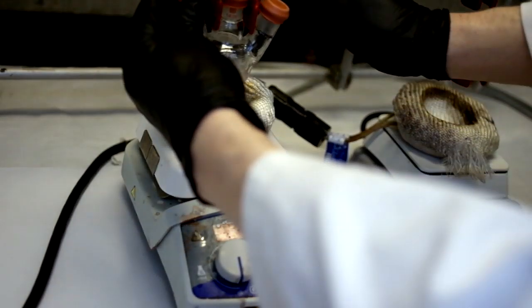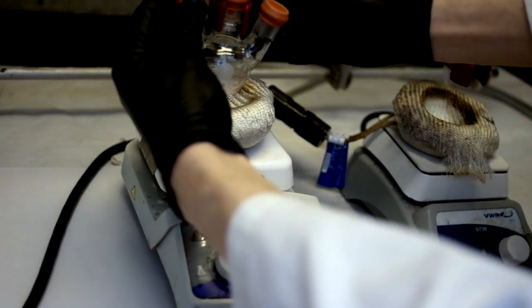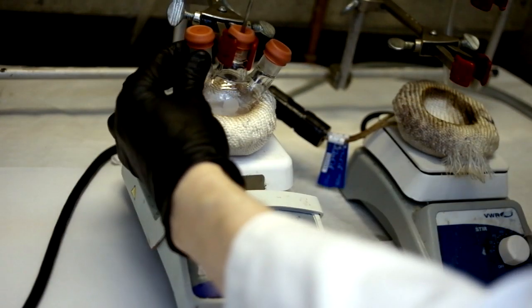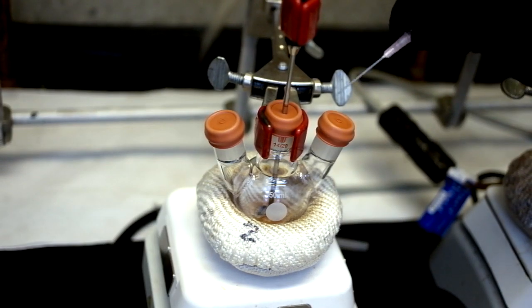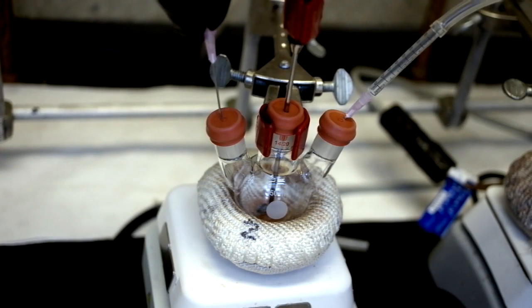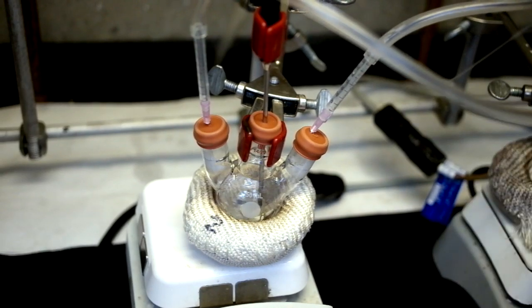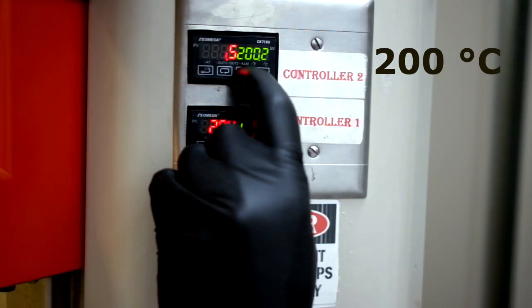Begin by placing the reaction flask onto the heat mantle. Insert the temperature probe and set up an argon flow. Begin the stir bar and set the temperature to 200 degrees centigrade.